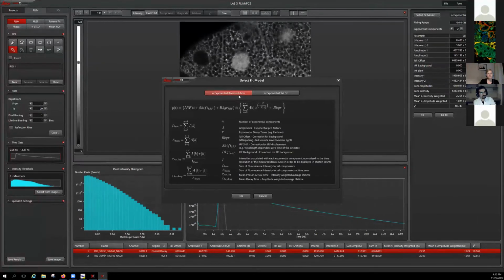Yes, Mariano, I can show you. It's not really that interesting, but sure, I can show you how the phasor plot would look like.